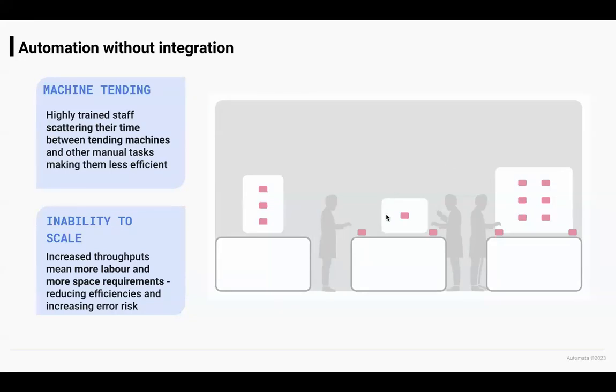And they've probably increased the efficiencies of these laboratories. It will increase their throughput, it will increase their hands-off time, but it still requires a certain level of machine tending by the scientists. What I mean by that is something that's very personal to me: you might be running something like a library prep on a liquid handler, but you are still required to tend to that machine. That might be taking a plate off, sealing it, centrifuging it, unpeeling it, putting it back on the machine.